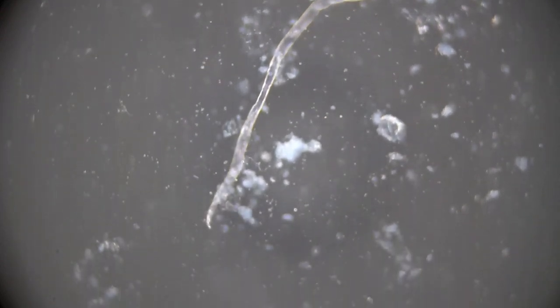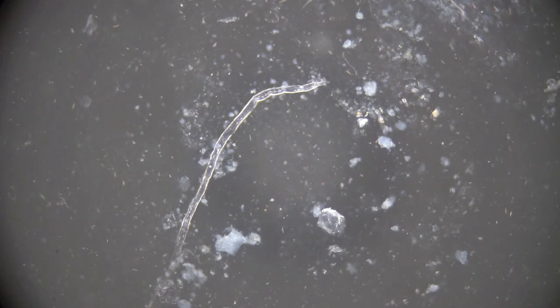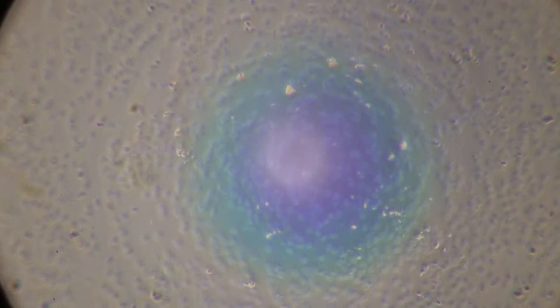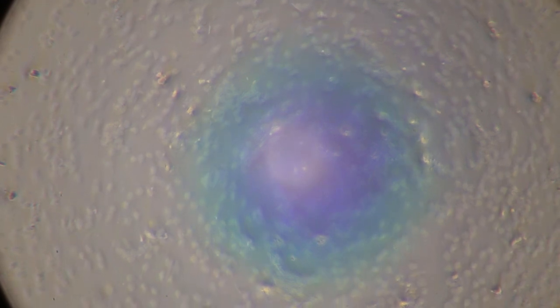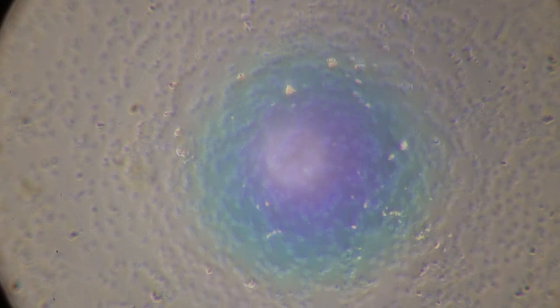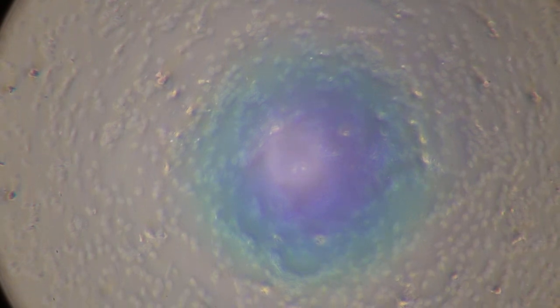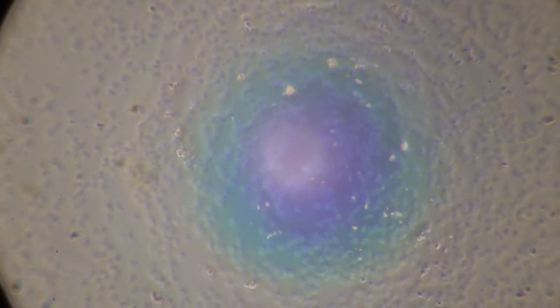I've evacuated some of the fish's waste onto a slide to take a look at what was in his tract at the end. This looks to be some kind of a worm maybe — this long thing right here could be wrong, but it looks like some kind of a worm. It does look like there's some kind of a parasite in the feces of this fish. There are billions and billions of these little tiny round things — kind of reminds me of the cysts or eggs of roundworm, but I'm not sure. These tanks are going to get medicated now, just to go through a little more preventative quarantine and medication. These fish did come from the wild, so I do expect to find some things in them.